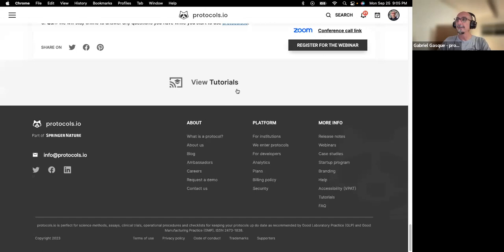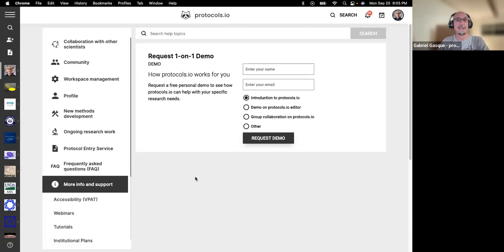We also have a series of pre-recorded tutorials, and there is a link to request a one-to-one demo. In these demos, you will talk privately with one of our specialists, and you can share your screen, they can share their screen, and have a very interactive conversation about any question that you might have about Protocols.io.